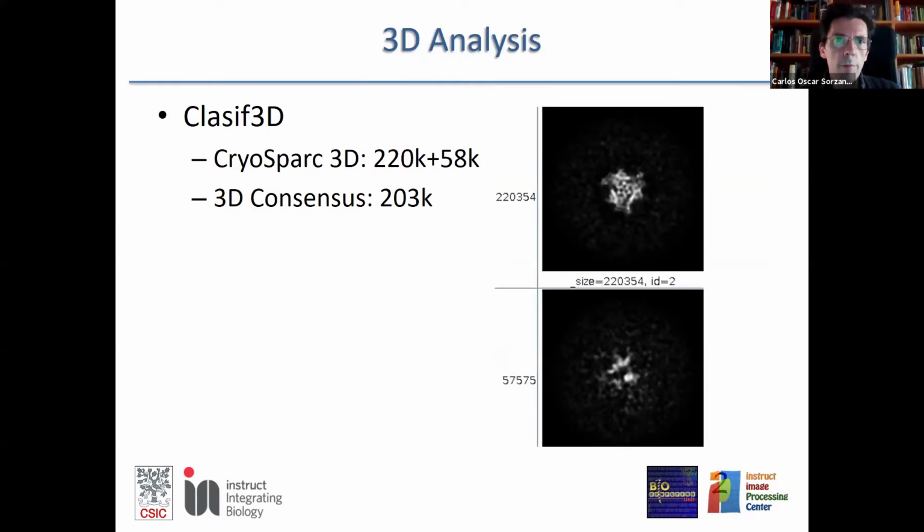And 3D classification can be another way of cleaning your particles. For instance, at the end of the previous steps we had about 280,000 particles, and using a single 3D classification step, you classify into 2 classes. You still see that 20% of the particles went to a bad class, so they couldn't reconstruct a meaningful structure. This is very typical, and for the 80% you would go further.